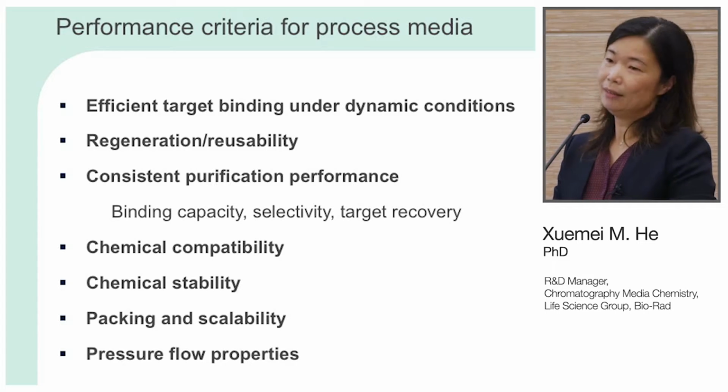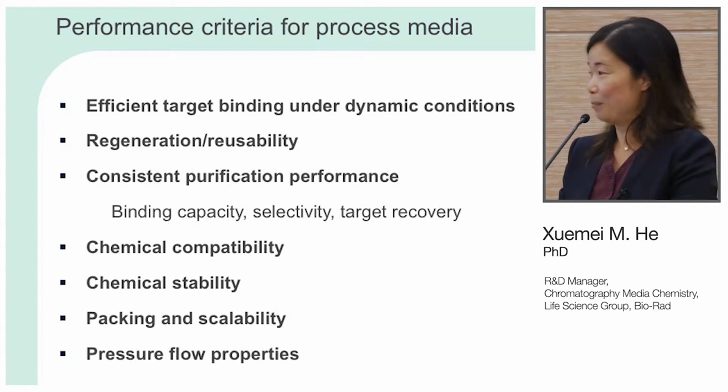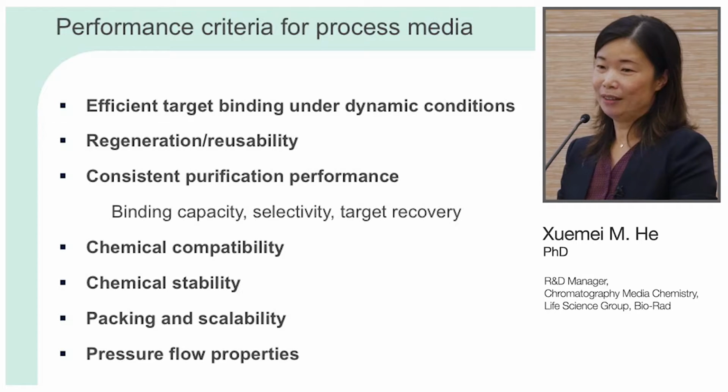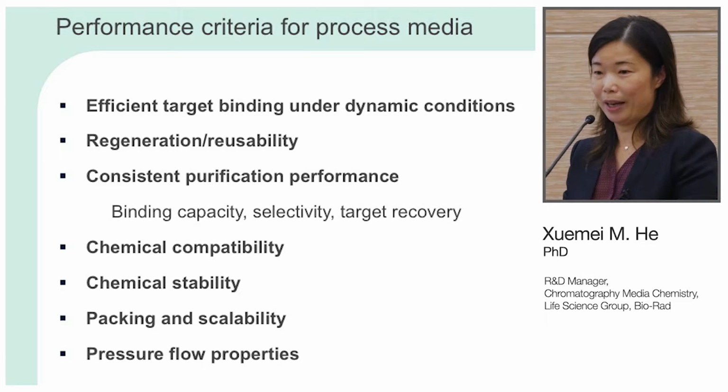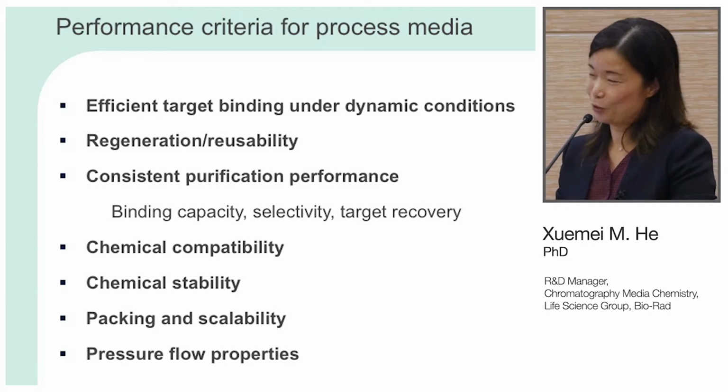And the resin has to be able to pack into a large column easily, will not collapse, will not generate high pressure, and you can run the production at high flow rate without seeing the column get packed and the flow stop.